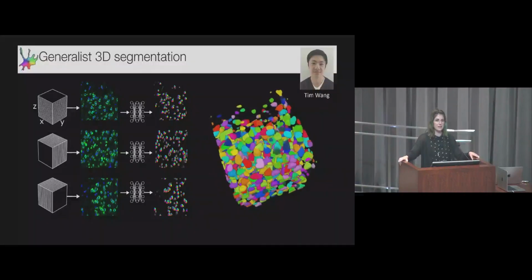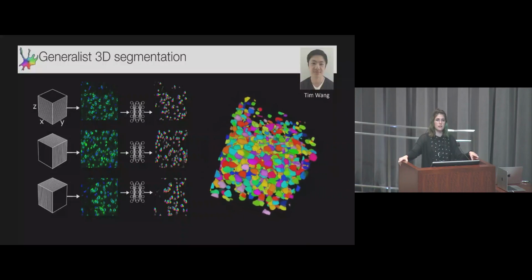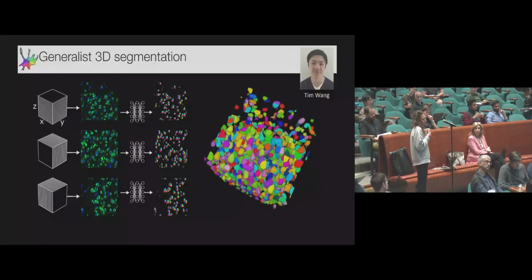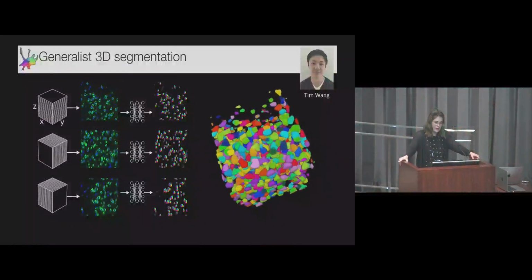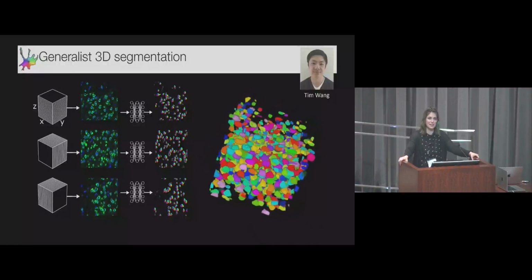I think it's hard to take SAM out of the box, because it's limited in the number of objects it can track, so you need to do something smarter. But I think these transformer architectures could be very good for cell tracking too, though we haven't tried it.